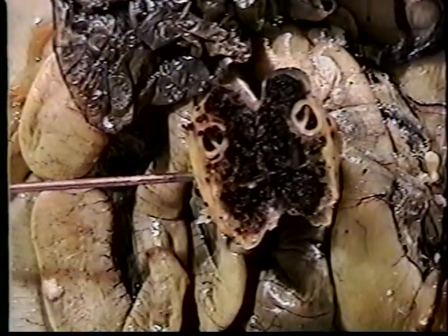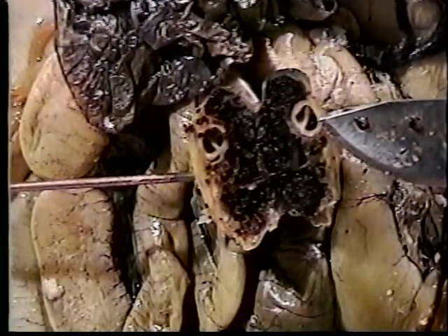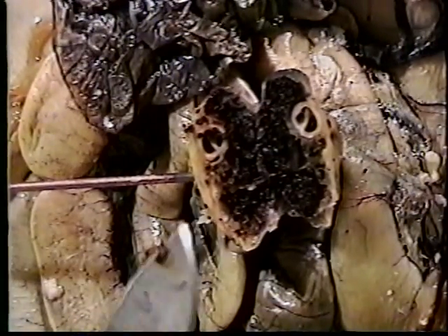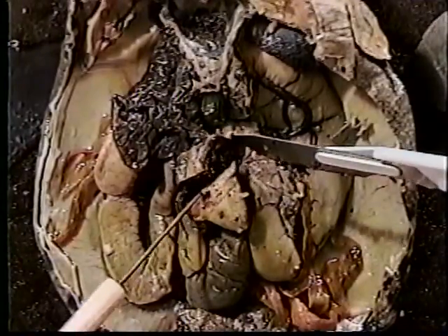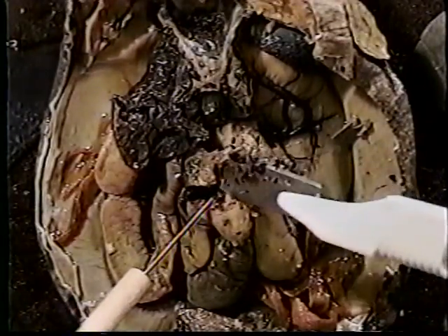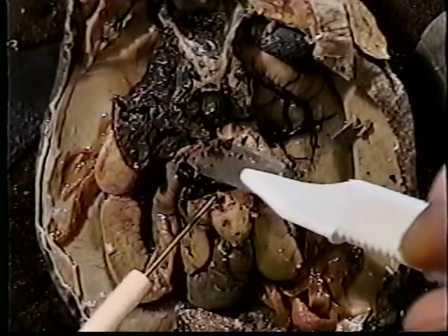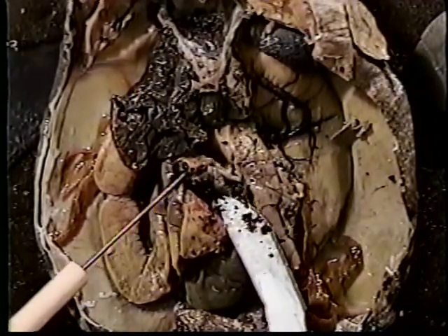At closer examination, we can see the connection between the auricles and the ventricle. Although we are unable to see the actual differences in the two chambers, we can see the larger tubes that bring blood in and out of the heart.